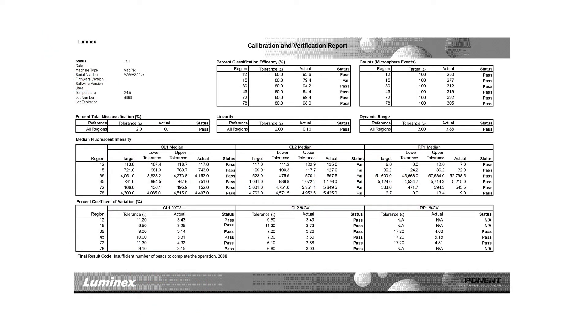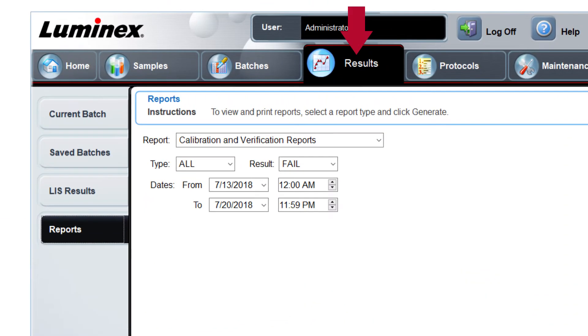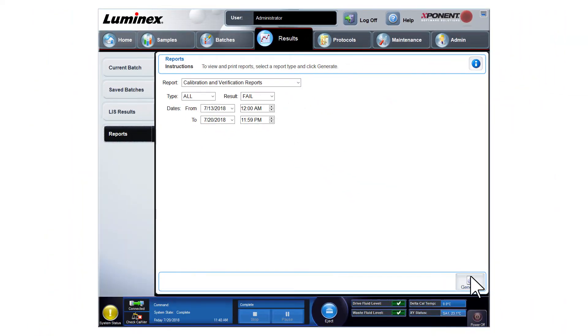When experiencing a calibration and performance verification failure on the MAGPIX instrument, first review the calibration and performance verification report to identify the failure. You can find the report by going to the results page Reports tab. In the Reports drop-down menu, choose the Calibration and Performance Verification report. Choose Fail from the drop-down menu to view only failed reports. Ensure the date of the failure falls within the date range selection. Click Generate.